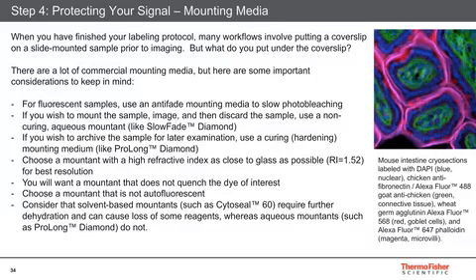You'll want a mountant that does not quench the dye of interest. For instance, VectaShield will quench far red dyes like Alexa Fluor 647. So you want to make sure from the company you get the mountant from what dyes are best in that mounting medium and which ones are to be avoided. Our ProLong and SlowFade products work with pretty much any dye and are optimized for our Alexa Fluor dyes as well. ProLong Diamond even works with fluorescent proteins, unlike most.